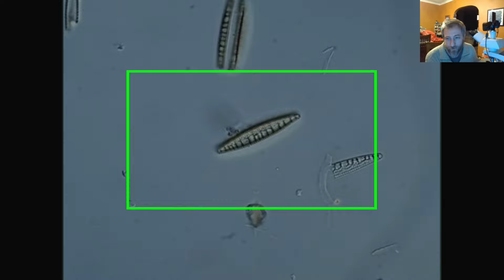Mark asks, are those dead? Yes, they're dead now, and they're also mounted in an epoxy.